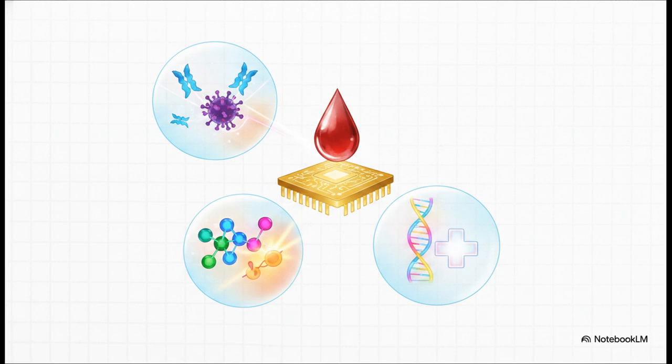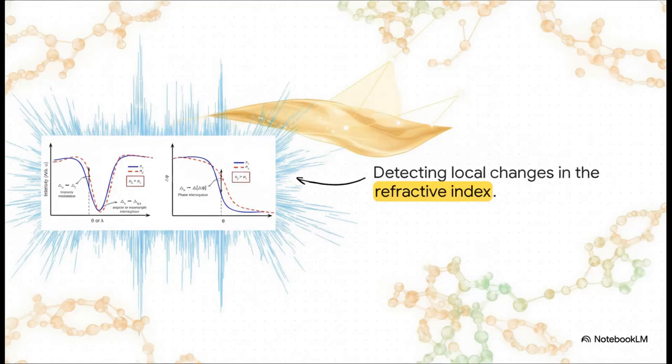And even more amazingly, SPR is being deployed right now in clinical diagnostics to detect minute protein biomarkers in human blood serum, paving the way for the early detection of devastating conditions like pancreatic cancer, ovarian cancer, and coronary artery disease.